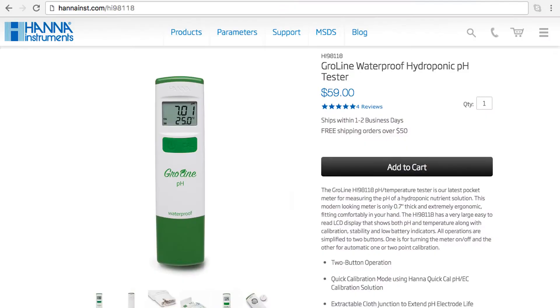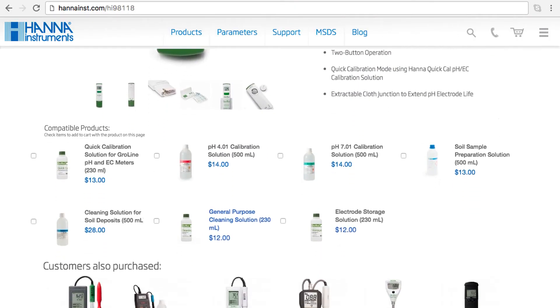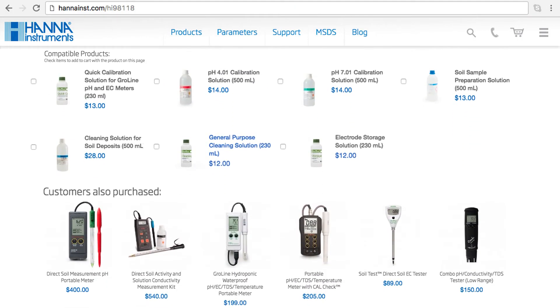Before running out of these solution samples, I recommend you check our compatible products on our website. For this tester, I recommend our HI-5036-023 Quick Calibration Solution, the HI-70300-023 Growline Storage Solution, and our HI-7061-023 Growline Cleaning Solution.